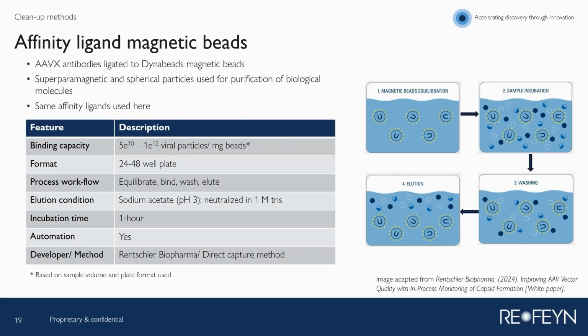Again, this can vary based on the sample volume and the plate format that you're going for. The developer for this method is Rentschler Biopharma, and the method was called the direct capture method. The format they used here was a 24 to 48 well plate. To highlight again, incubation time is about an hour, but automation is possible here, unlike the resins, because a magnetic plate or a stand can be incorporated into the automated workflow.